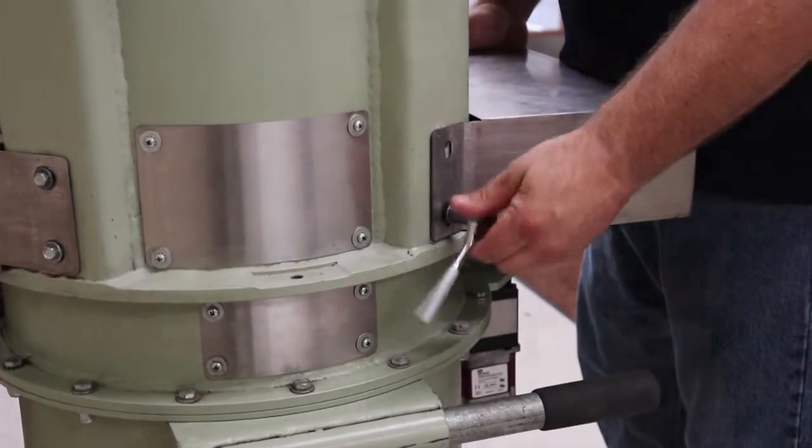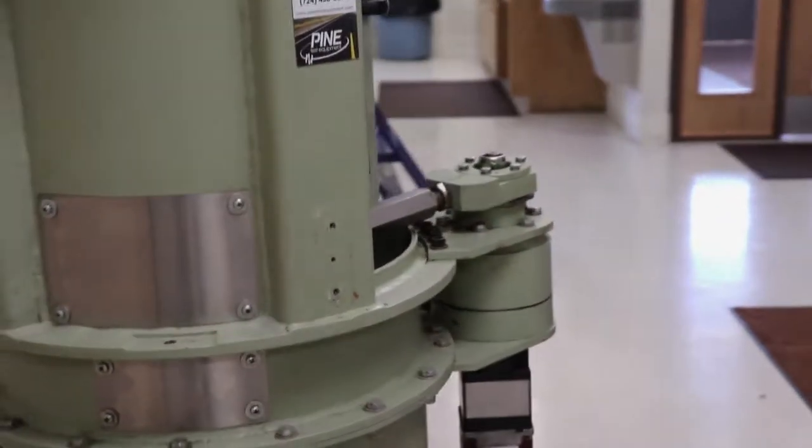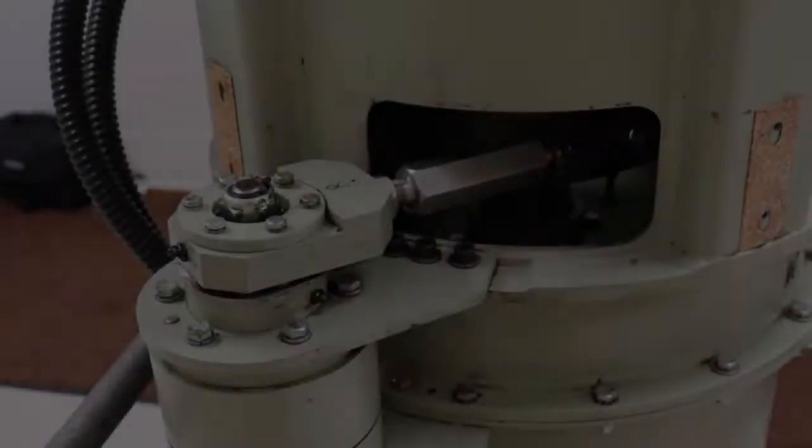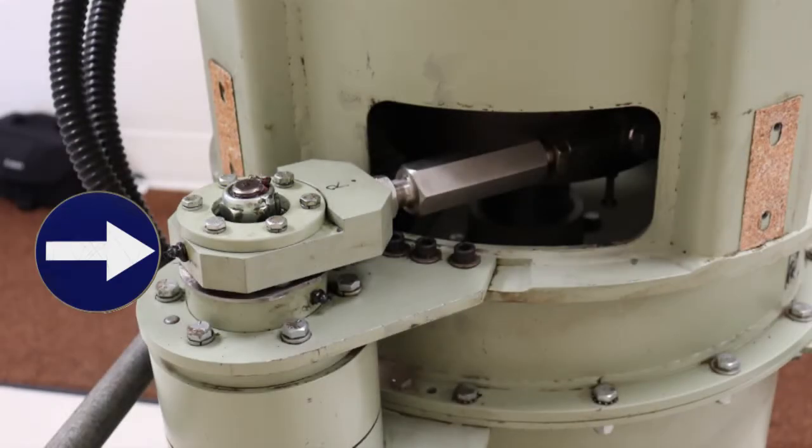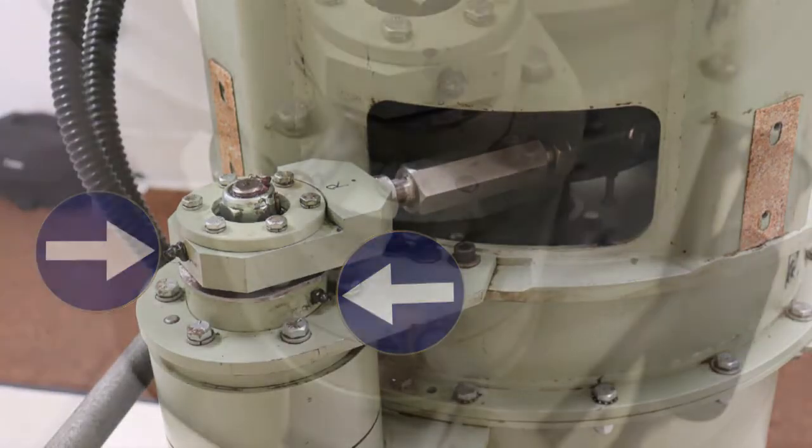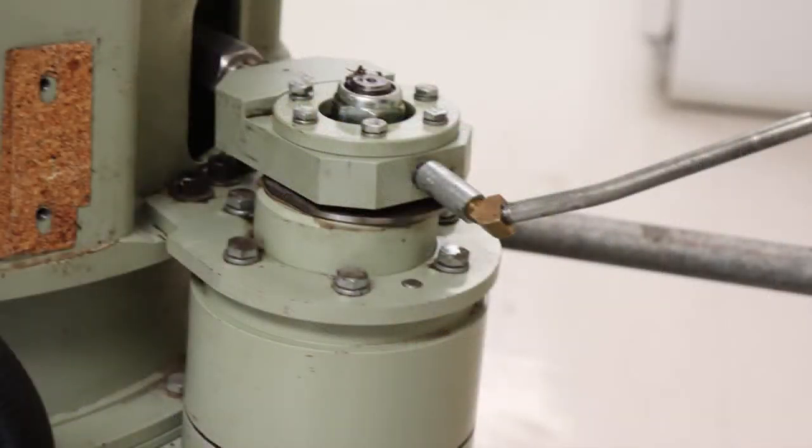Begin by removing the front and rear actuator arm covers and screws. Grease both the actuator arm grease fitting as well as the actuator arm crank grease fitting in the front and rear of the machine.